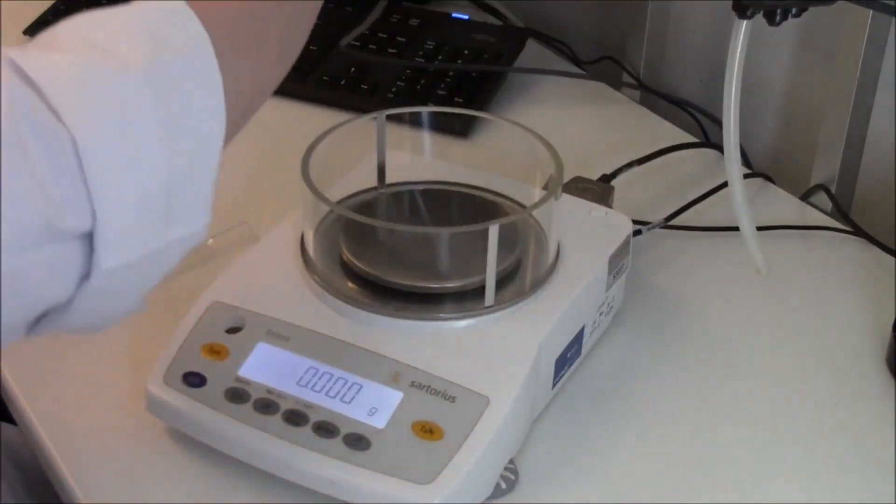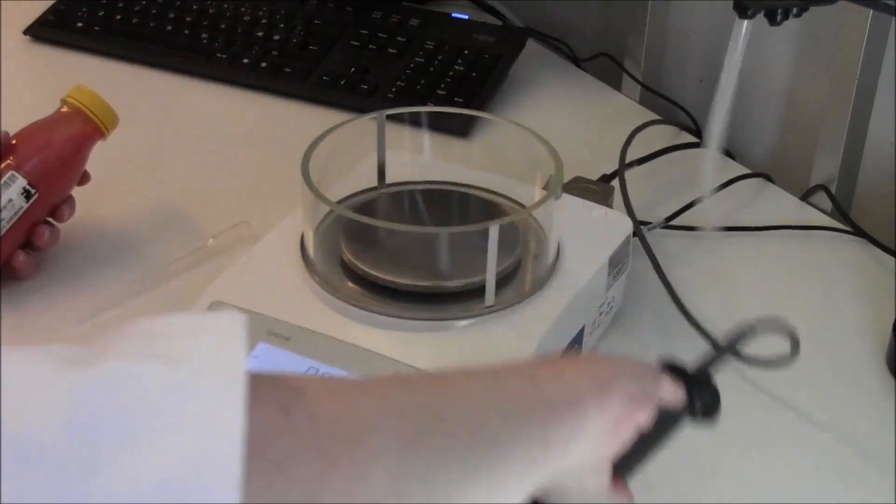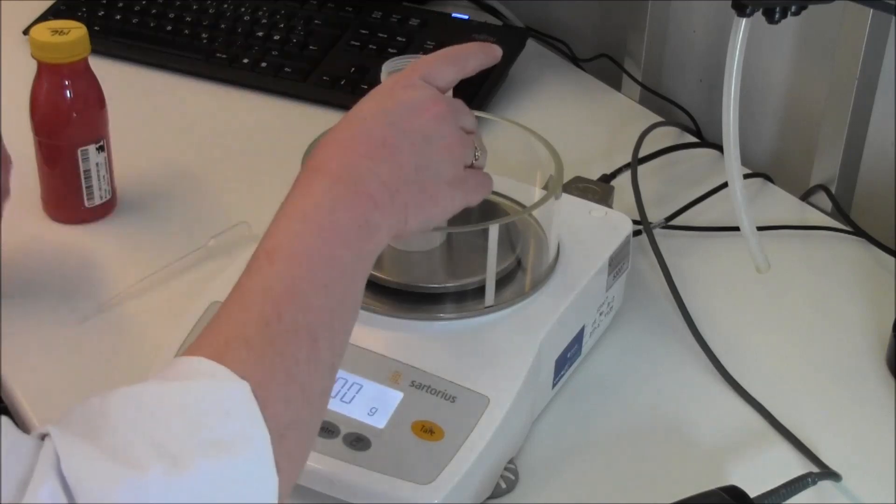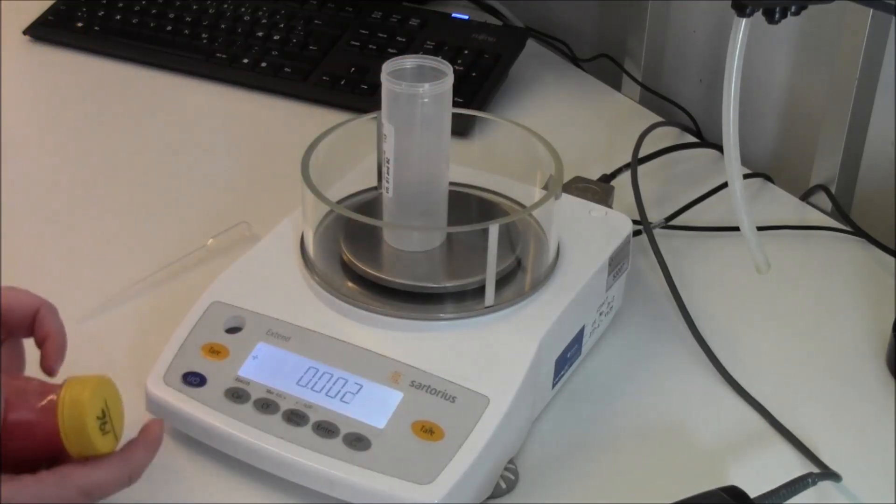All samples to be analyzed in the Vitamin Competence Center are scanned and weighed. The weight is electronically transferred from the weight watchers system into Chromelian.